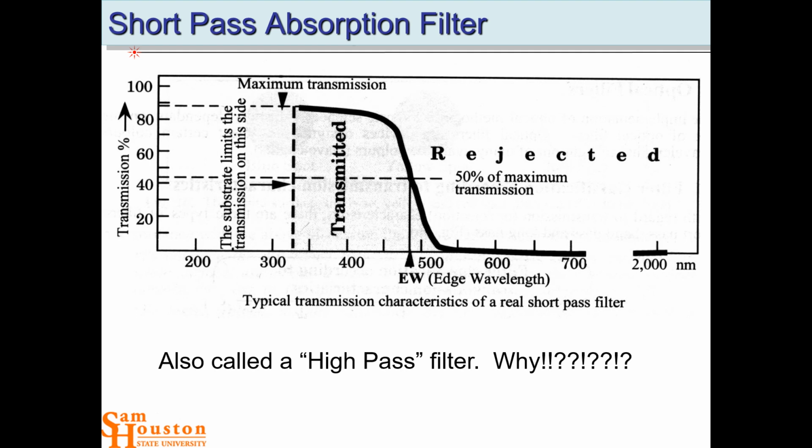And we picked that 50% wavelength because, depending upon the thing that's absorbing, that slope may not be as steep as you'd like. And so you've got to make a call. How are you going to label this filter? Well, you pick the 50% mark. So no matter how shallow that line is, it's going to cross 50% someplace, and then you report the wavelength for that.